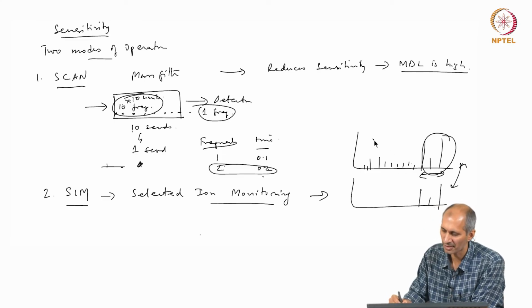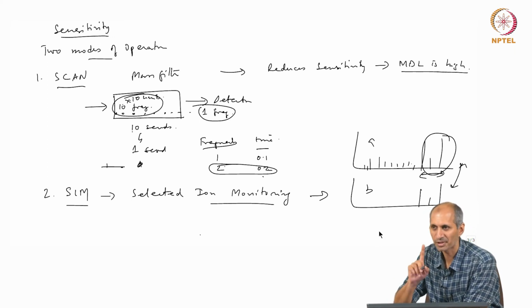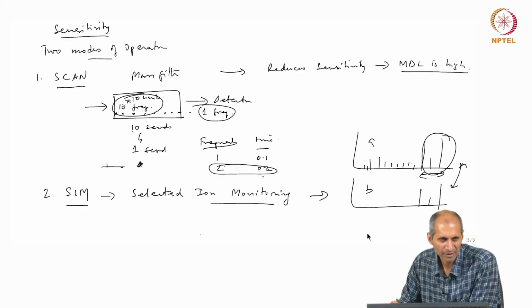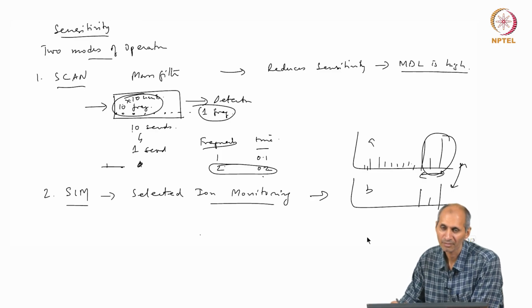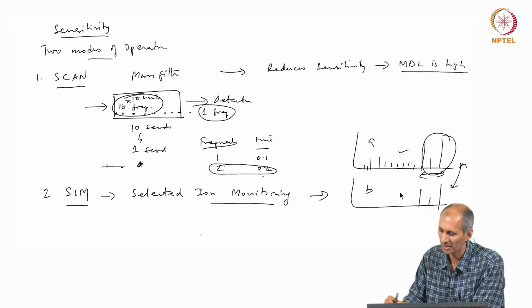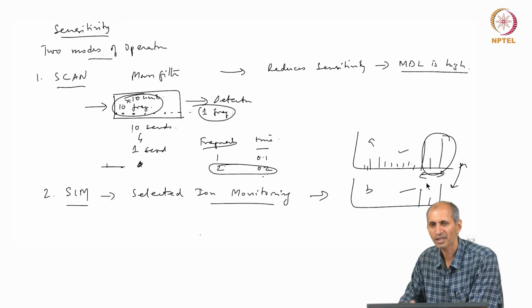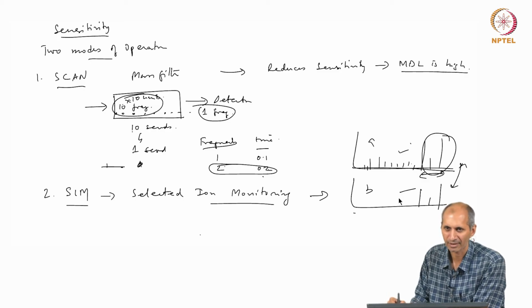No, what is the difference between A and B? Not many other compounds. No, this is one compound, this is a mass spectra of one compound. So, the difference between A and B in terms of information? Mass reduces. Mass will be reduced. What can you do with this which you cannot do with this? What can you not do with B? If I give you a mass spectrum like this, the original mass spectrum, scan mass spectrum is A. The match may not be perfect.